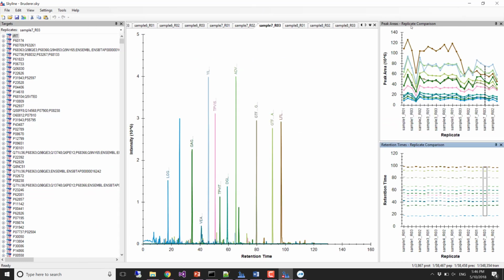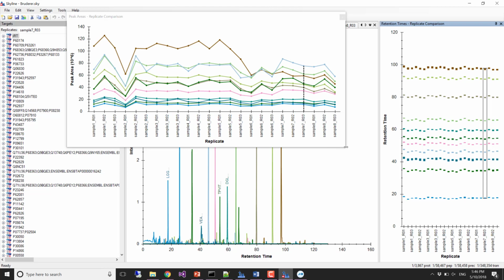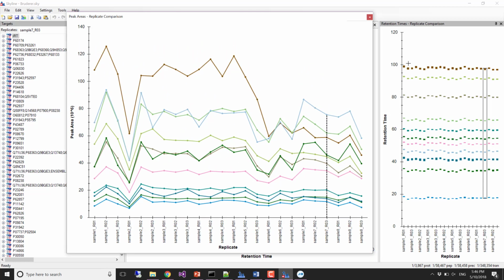And then if I pull this out, you realize this once again. We showed last time that there was a case where a peptide, and maybe actually it was the last eluting peptide too, in that other sample, really dropped by 200-fold. This is sort of a 2-fold drop, or the other one dropped by like 100-fold. This is a 2-fold drop. But a lot of things drop, and clearly something went wrong with this run.